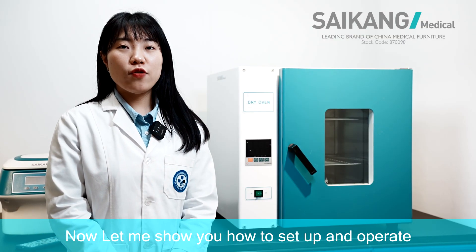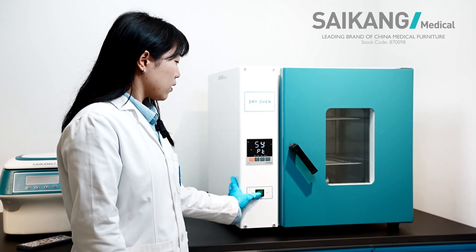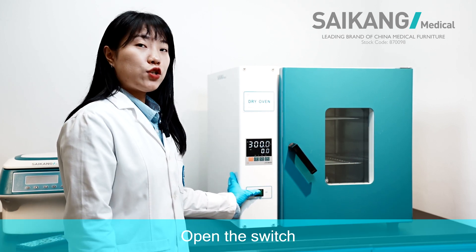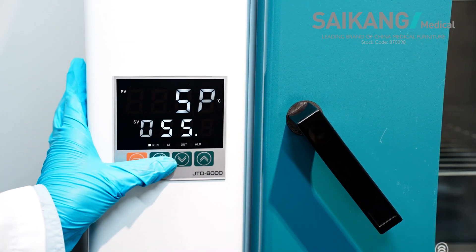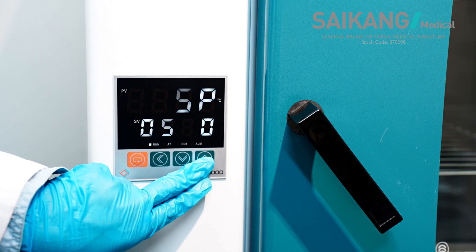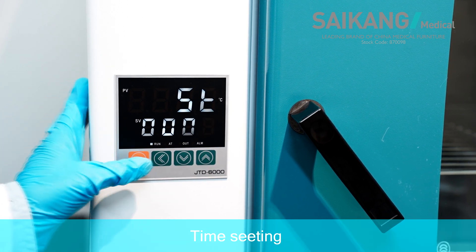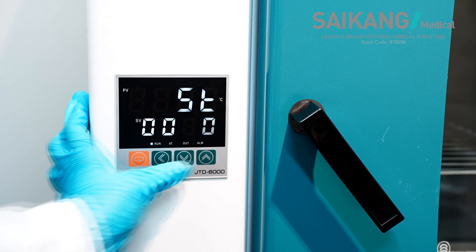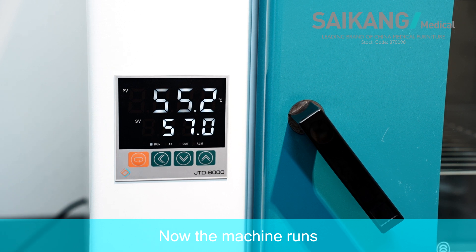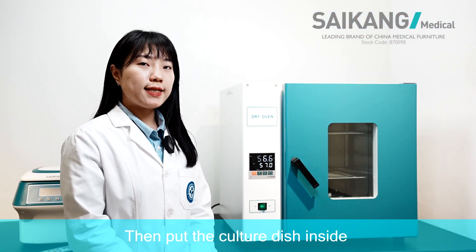Now, let me show you how to set up and operate. Open the switch. Temperature setting. Time setting. Now the machine runs. Then, put in the culture dish inside.